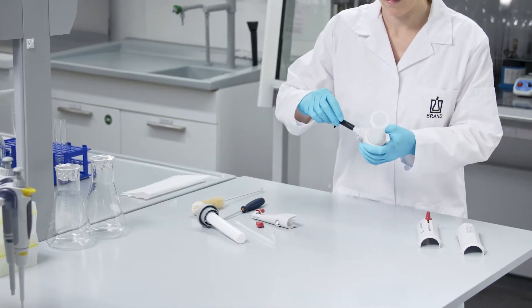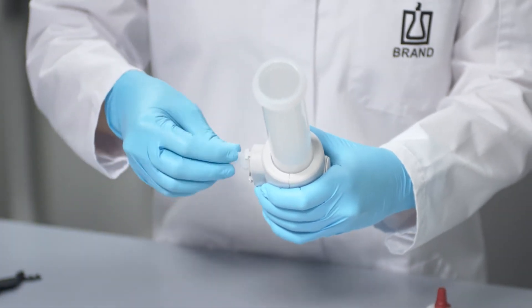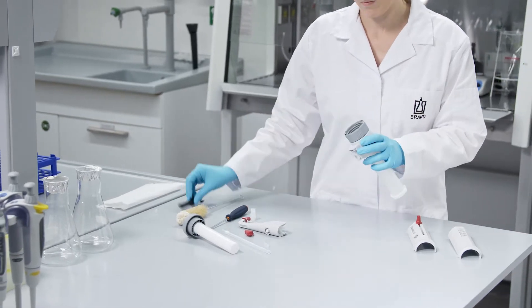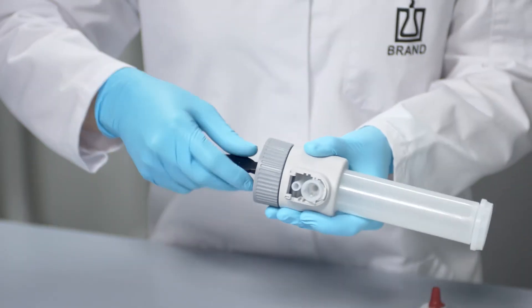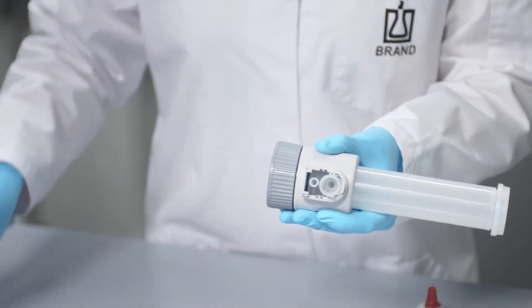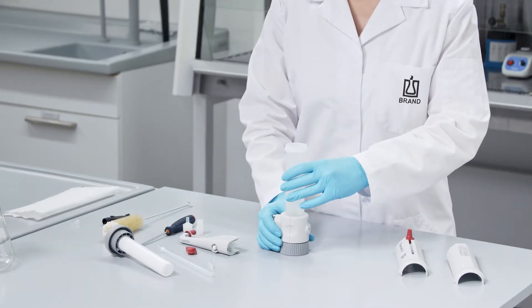Remove the discharge tube. Then use the mounting tool to unscrew the discharge and filling valve. You should not disassemble your Dispenset S any further.